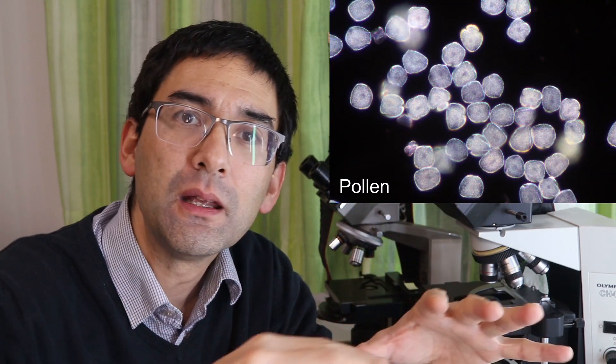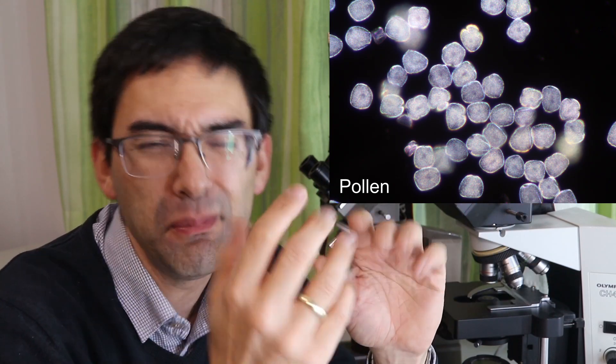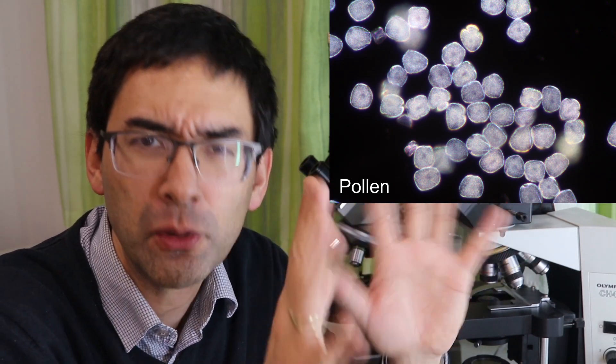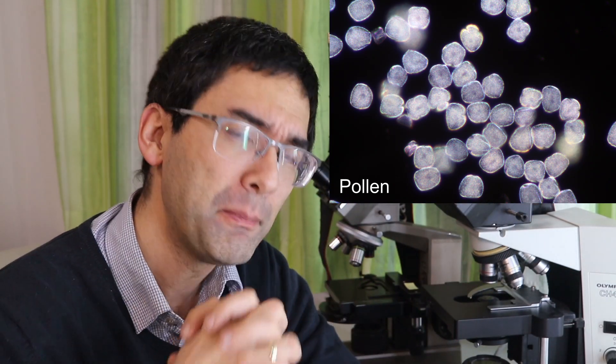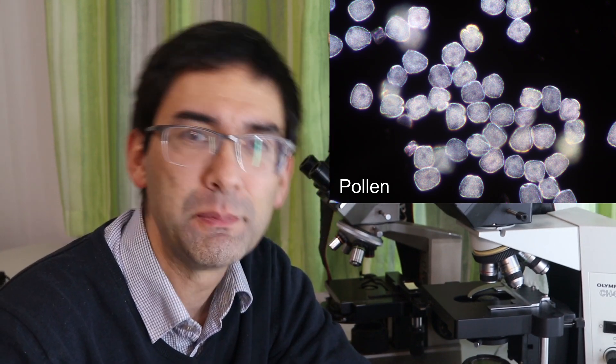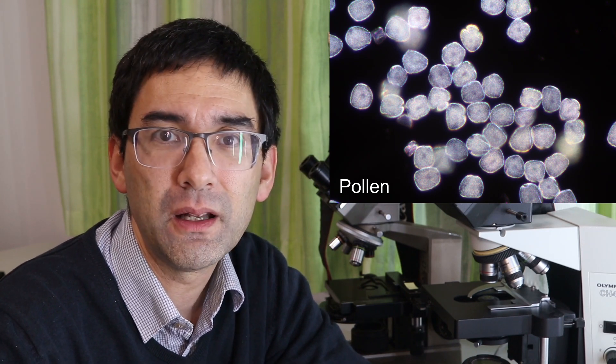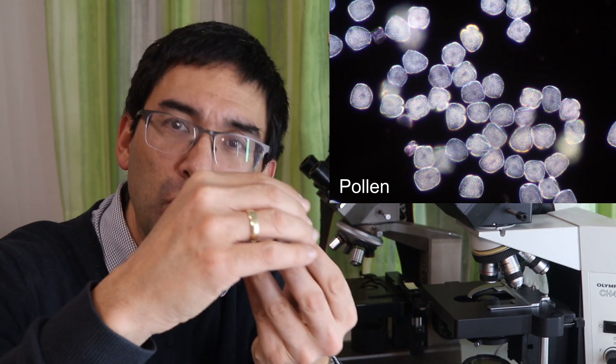And in dark field, what you see is you see the specimen bright on a dark background. It looks pretty nice. It depends on the specimen. Not all specimens are suitable, but generally looks quite nice. But you can only do that if your microscope has a condenser. And this specific microscope that you have does not have a condenser, at least not one that looks like this and not one that allows you to connect a filter. And so for this reason, what I recommend is if you get yourself a microscope, get yourself one also with a condenser.